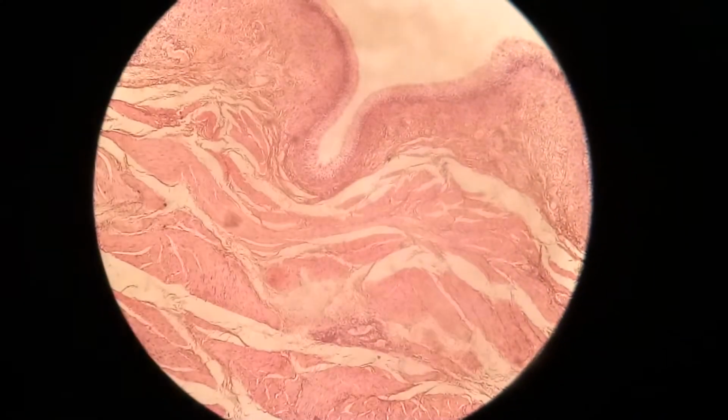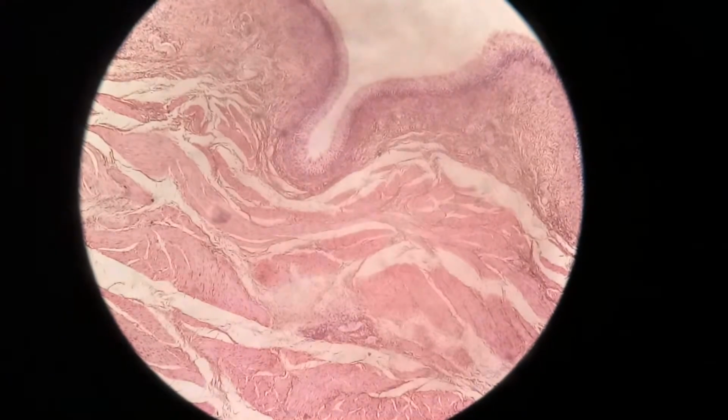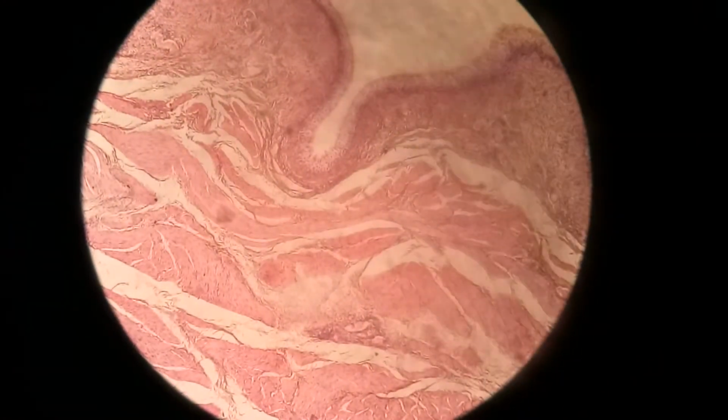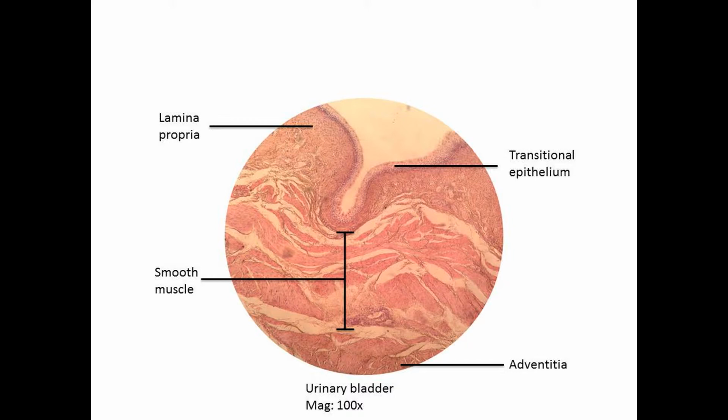The urinary bladder is made of several distinct tissue layers. The innermost layer of the bladder is the mucosa layer that lines the hollow lumen. Surrounding the mucosal layer is the submucosa, a layer of connective tissue with blood vessels and nervous tissue that supports and controls the surrounding tissue layer. The visceral muscle of the muscularis layer surrounds the submucosa and provides the urinary bladder with its ability to expand and contract.